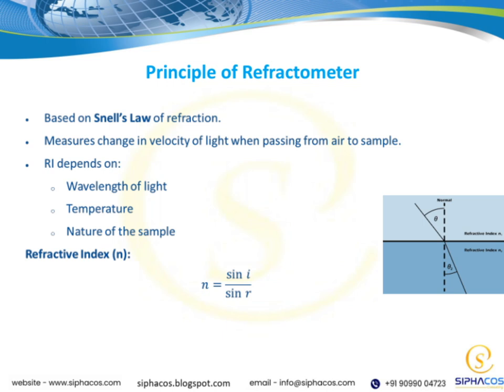Understanding this principle helps us see how the device ties into our overall goal: to efficiently analyze and monitor the quality of various liquids. Whether in food, beverages, or even in scientific research, the core idea is that the degree of light refraction reveals a lot about what's inside the sample. So, in essence, it's all about using the physics of light to get precise, real-time measurements.